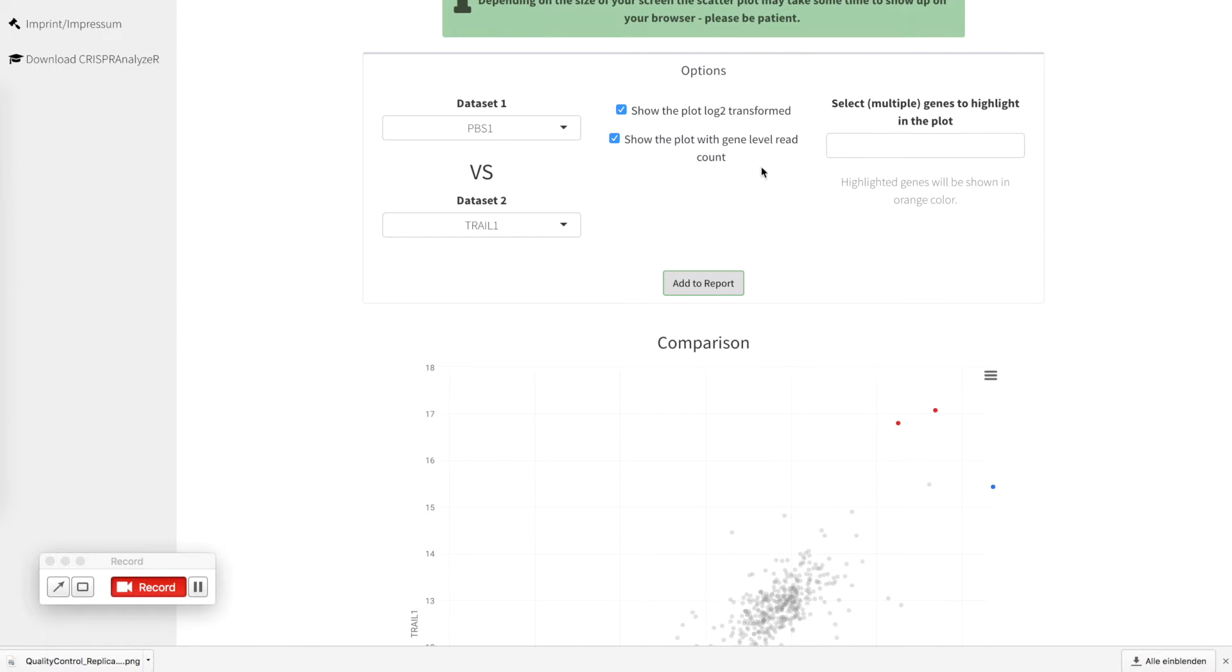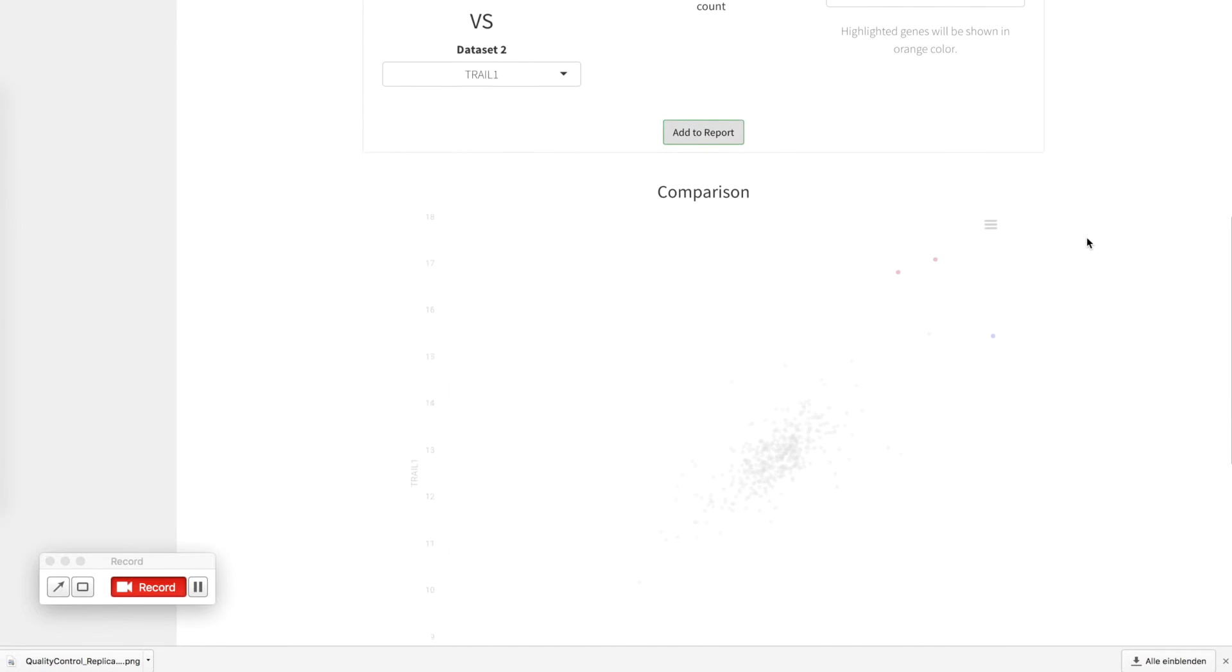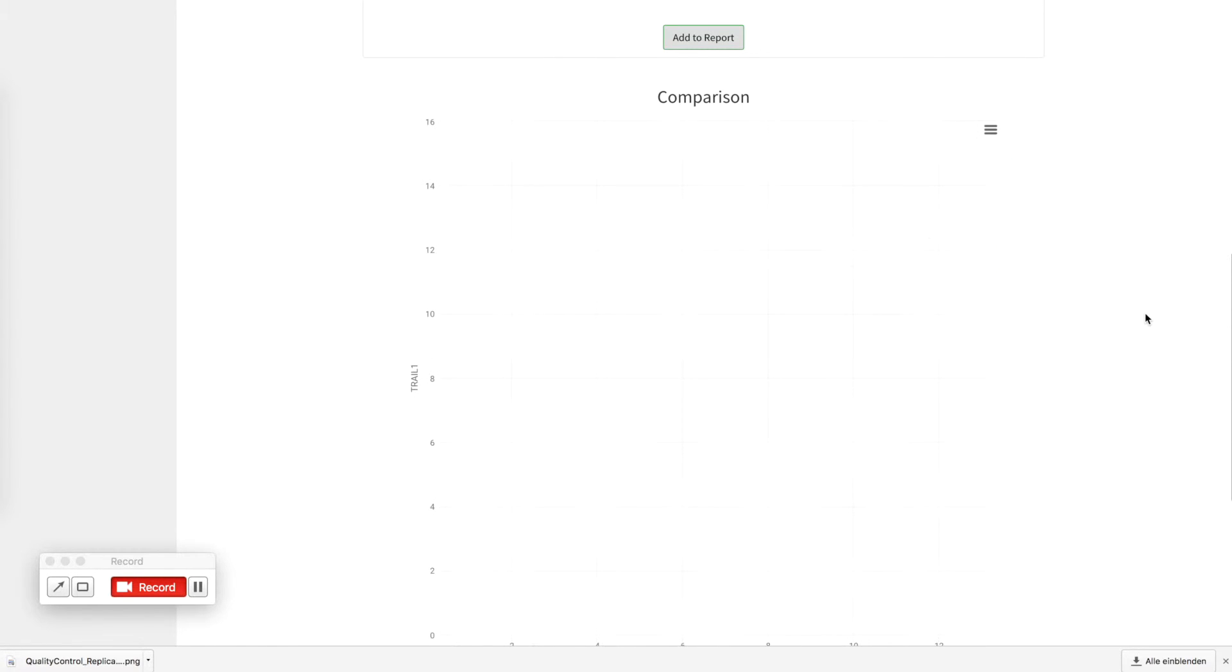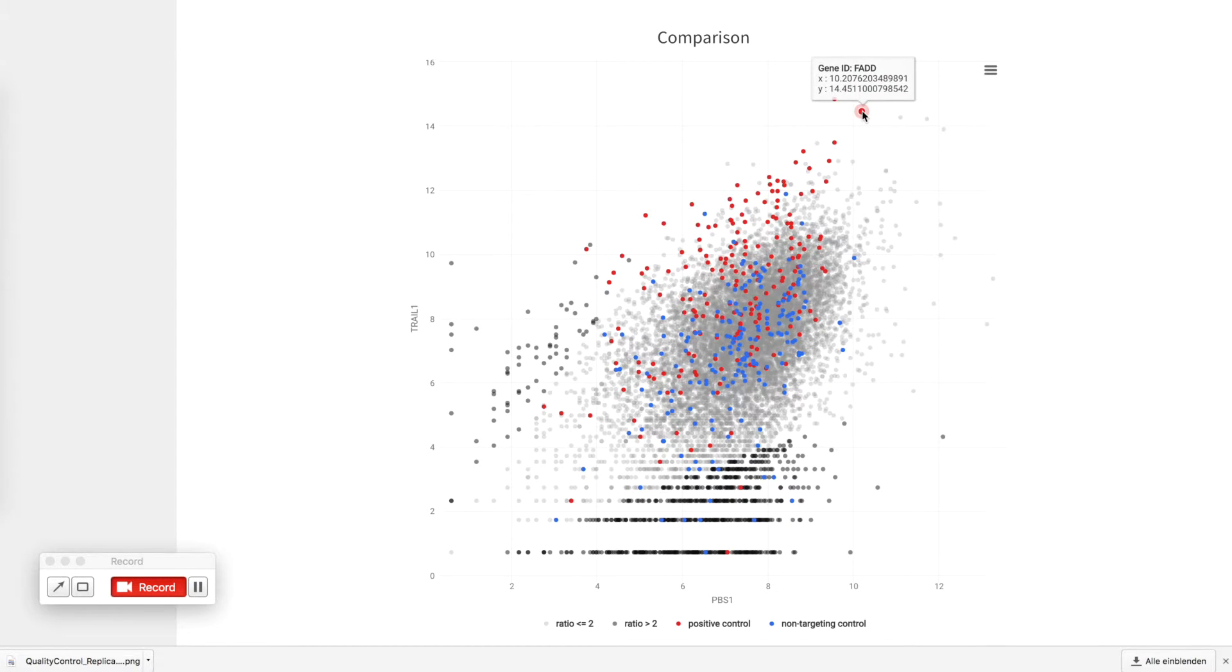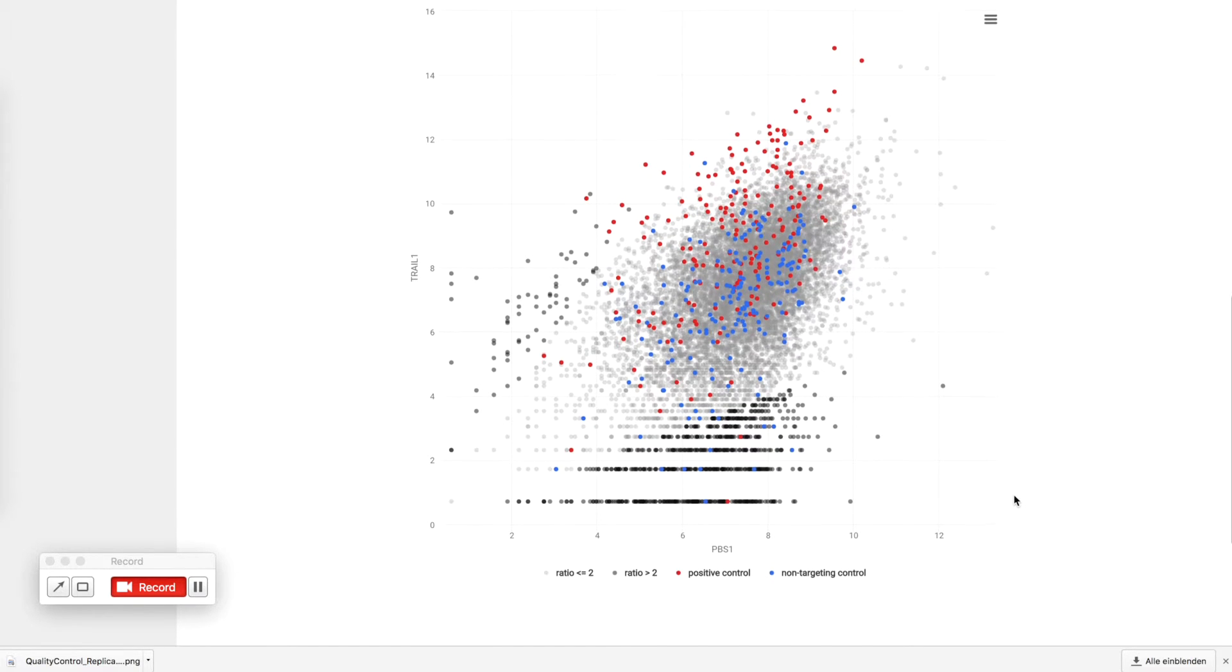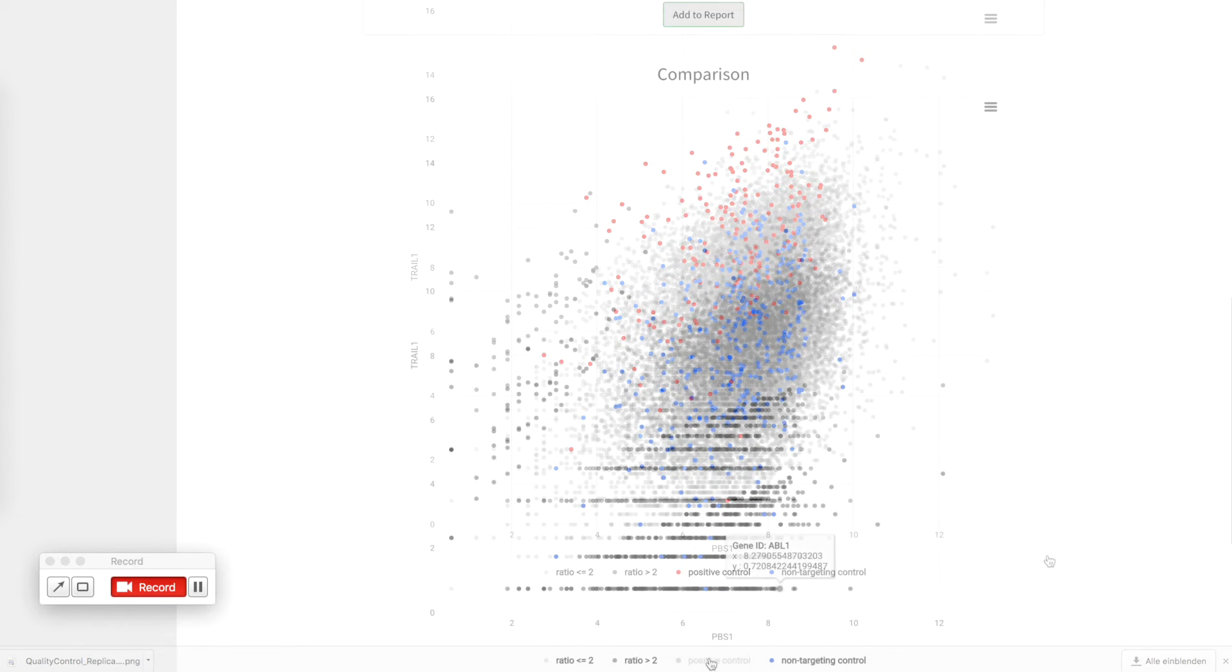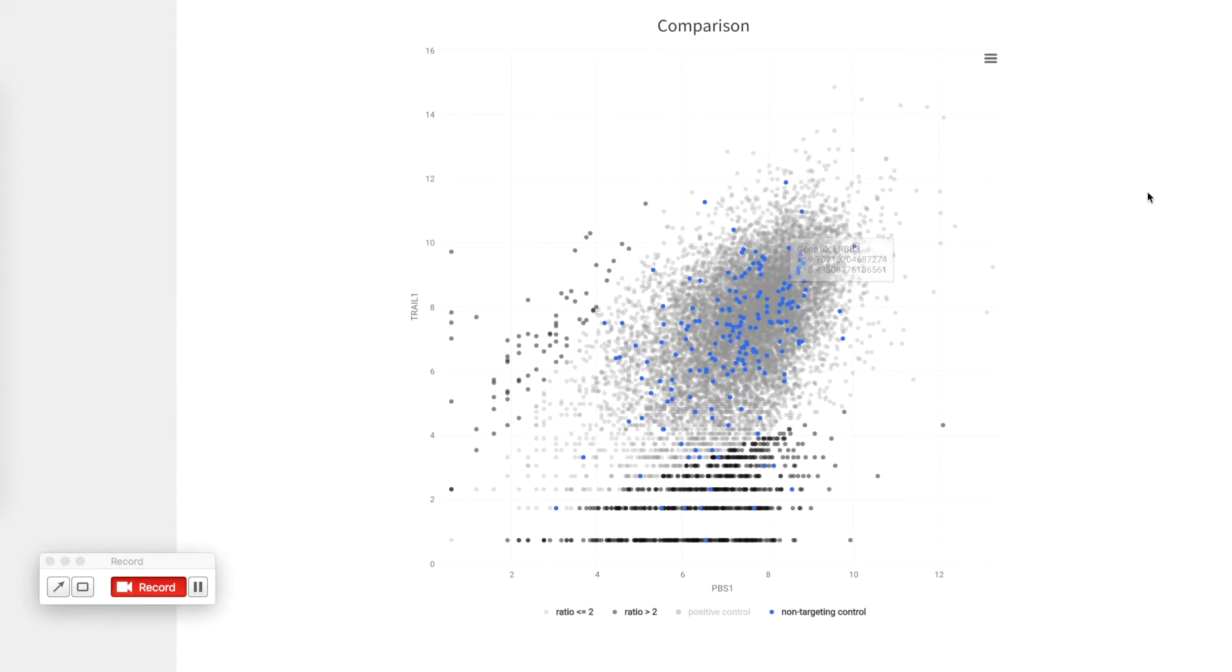If you also like you can get this plot shown on sgRNA level, please be patient since this depends on the computer speed that you have for visualization of the data. And now you can see each sgRNA of the positive controls showed in red color, of the non-targeting controls showing in blue color. And if you don't want to see them you can just ignore them by deselecting them here on the bottom. After you have deselected a positive control you can see that all of the sgRNAs have been removed from the plot.